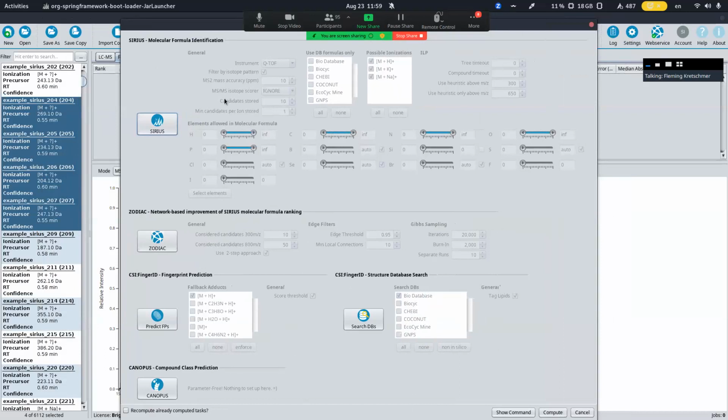So the question was, if you don't use preprocessed files, for example, from MZmine, but just drop in your mzML files, what is Sirius going to do? It will look a little bit different. You can also just drag and drop your files, but it will give you a few other options. For example, it will ask you to align your files during import. This is just one dialog box which is going to open up.